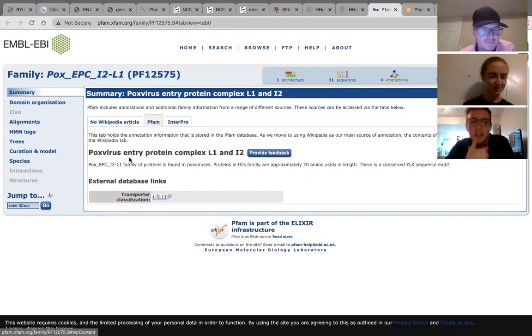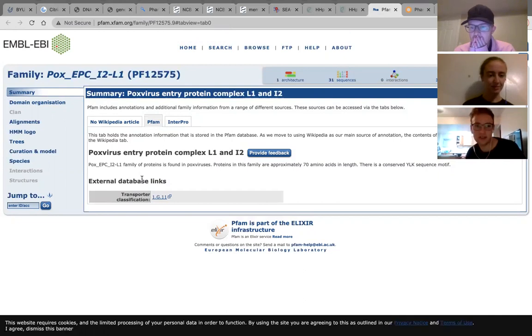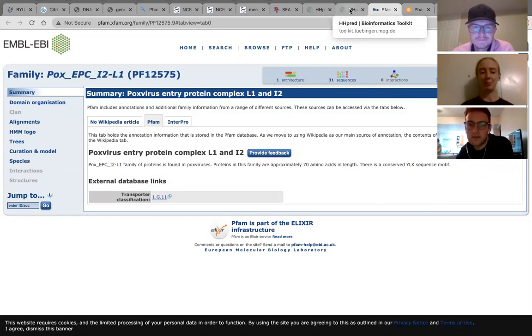No, but it's good because for this gene specifically, we have NCBI BLAST is so awesome that it's okay. Yeah, I'll say this one, it doesn't matter, but hopefully you'd be able to click on it and it would come up with more information and tell you where the gene was and all the other stuff that you need to know. And then the one big thing for this one is our alignment.